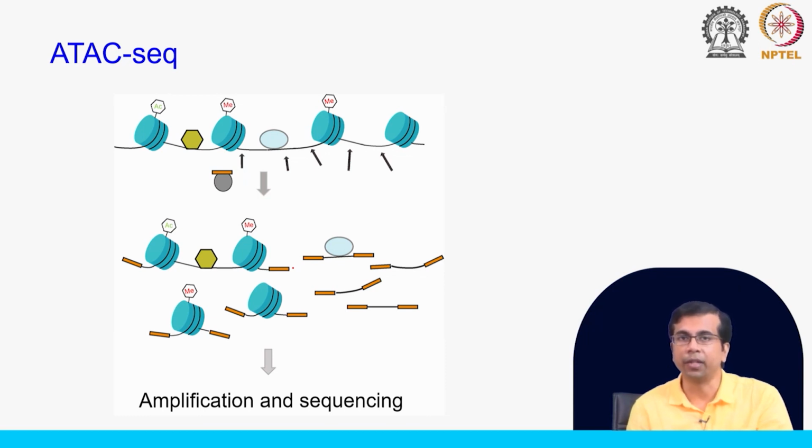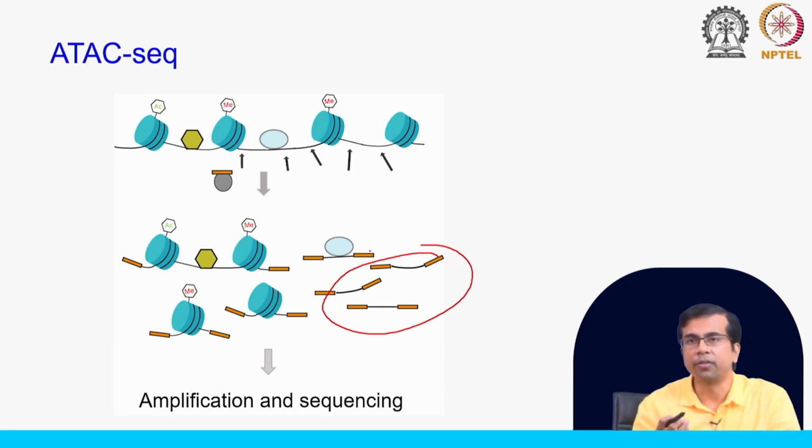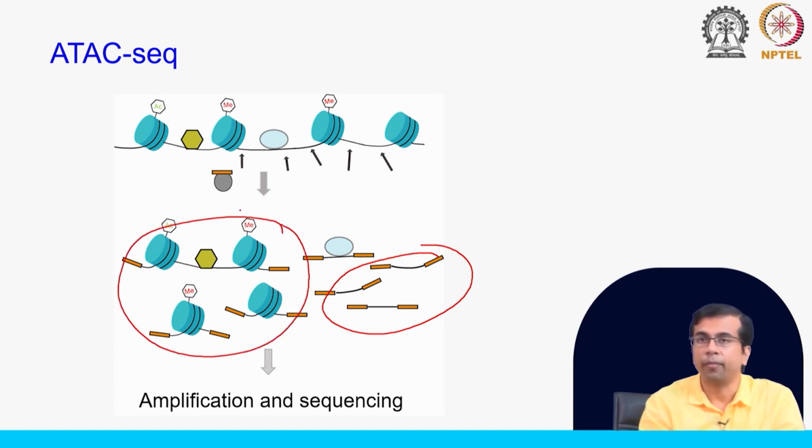Okay. So, once you sequence, you will get those fragments where the size is within a reasonable range, and these will mostly cover these open regions. Open regions will be quite small because they are accessible for this enzyme, and it will integrate this adapter across this. The other regions, again this will depend on how long these fragments are and whether the amplification actually works.